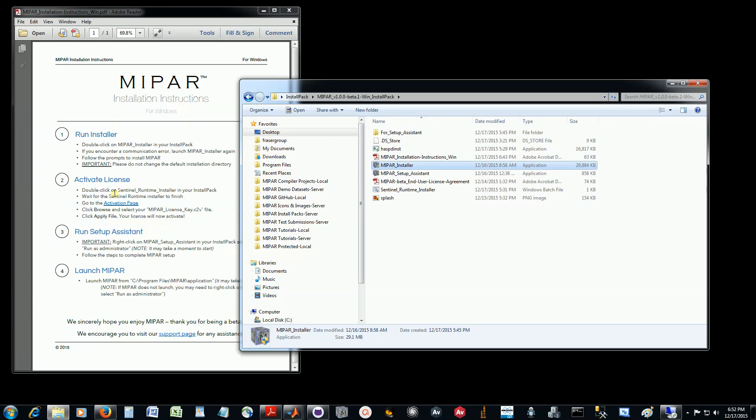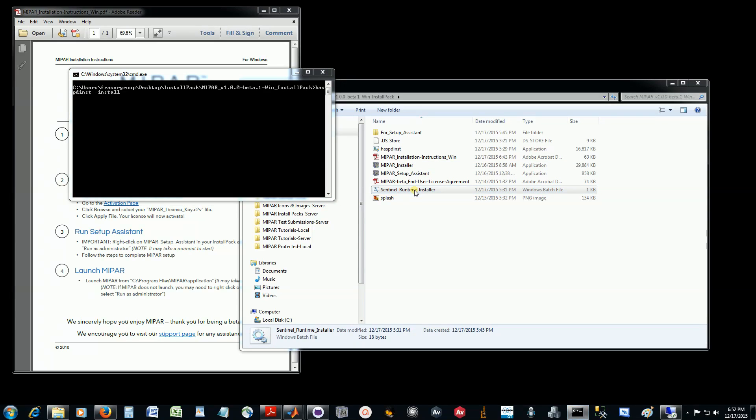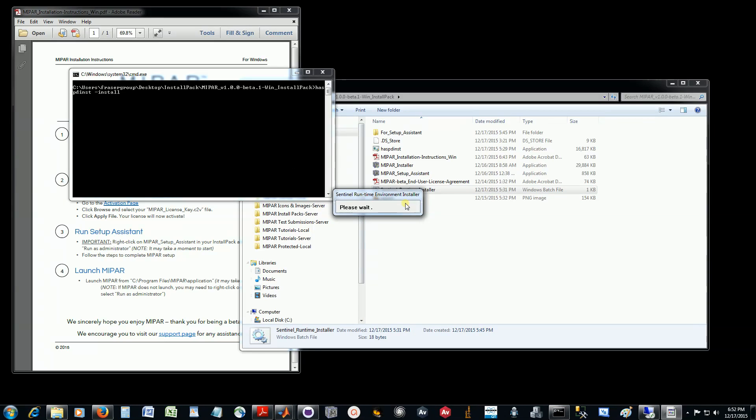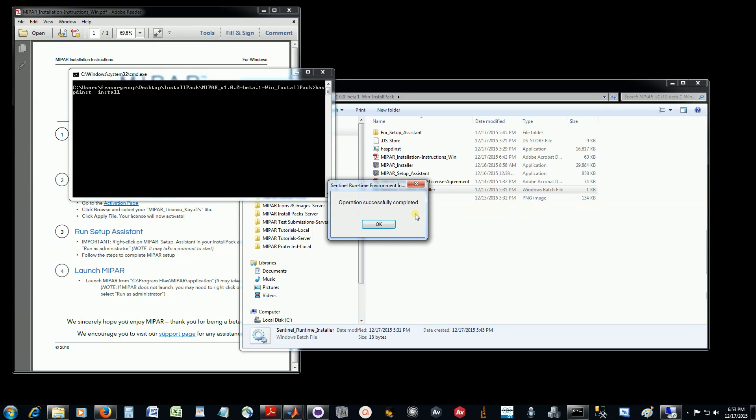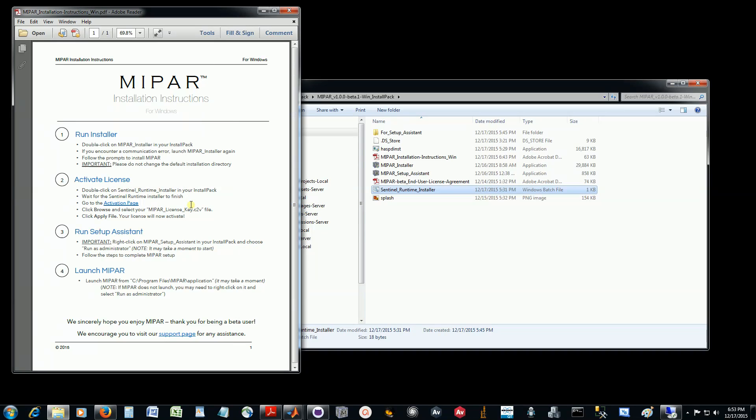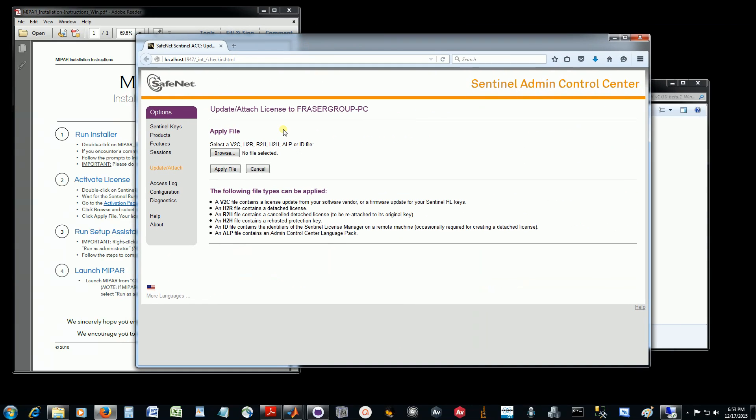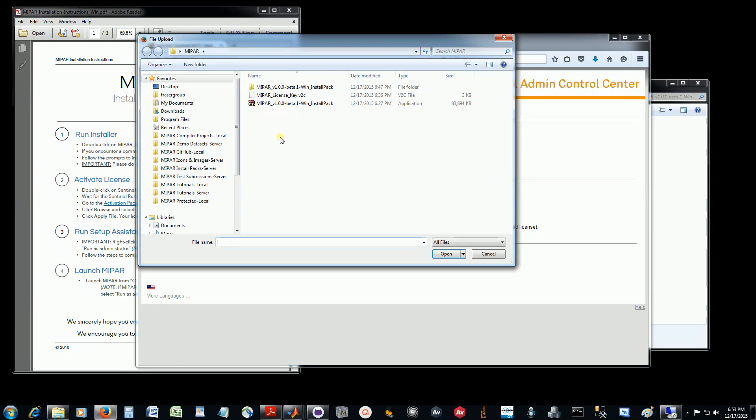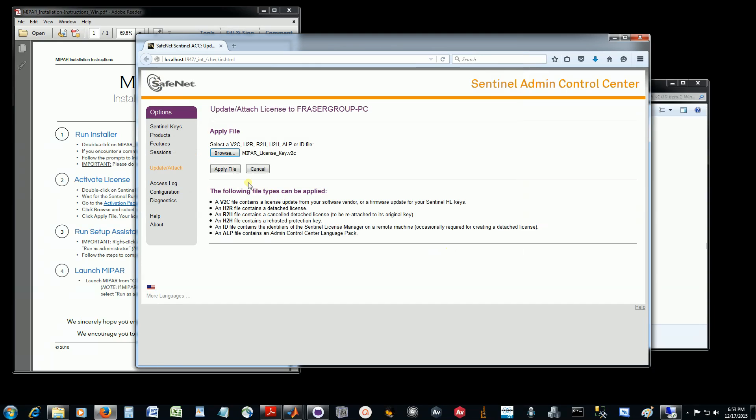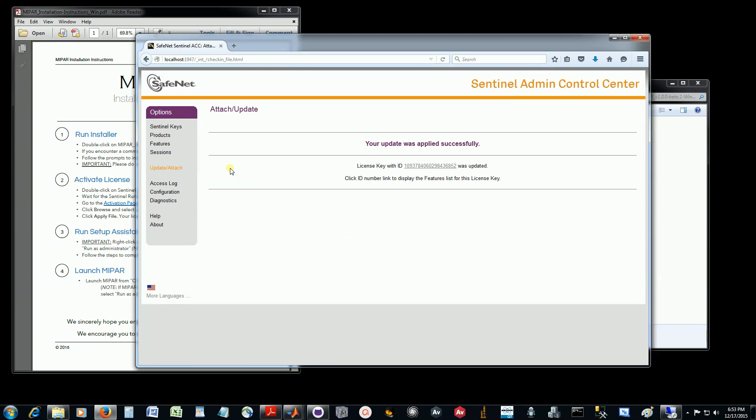Now we see the next step here is to activate the license. To do that, we'll begin by installing the Sentinel runtime by double-clicking on Sentinel Runtime Installer, and we will wait for this to finish the installation. Once that's complete, we can go back to our instructions and go to the Activation page by clicking on the link. This will open up a web browser right to your Activation page. We'll choose Browse and pick your license key file, then click Apply File. If it says your update was applied successfully, your license is now active.